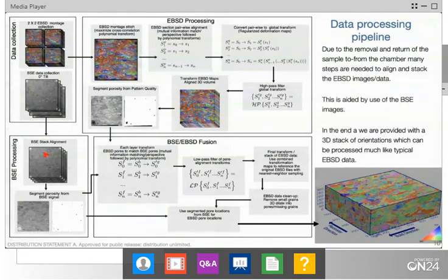In that, we basically just had to look at translations and how we translate over these relative to each other. This is done by looking at the phase correlation or cross correlation of the images. That gives us a relative translation from one tile to the next. And then we can use this data to actually segment out the pores that are present within here.